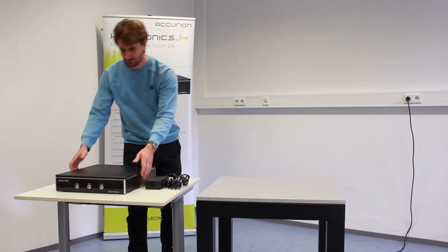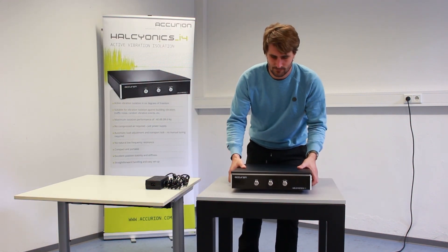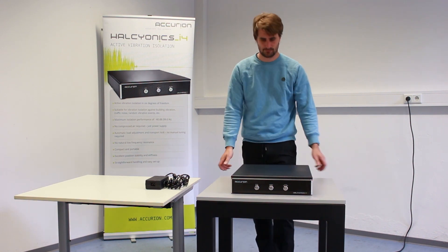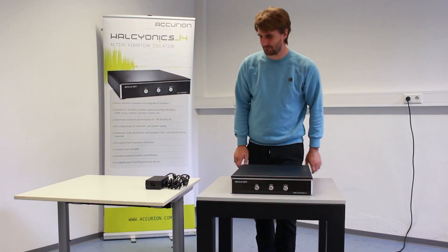Set up the system on a stable, rigid and flat surface. The floor of the operating space should be free of any soft covering. Please note that the proper support structure is essential for obtaining the best possible isolation performance.